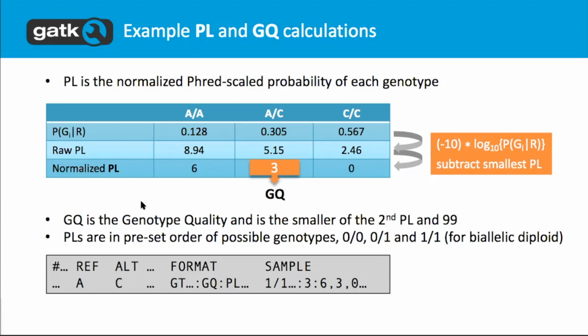Yeah. It's not based on the reference. That's correct, yeah. So it's the same basic one, but I believe you can provide a list of priors if you want to give different priors for different regions, I think. I would have to check that. Any other questions?